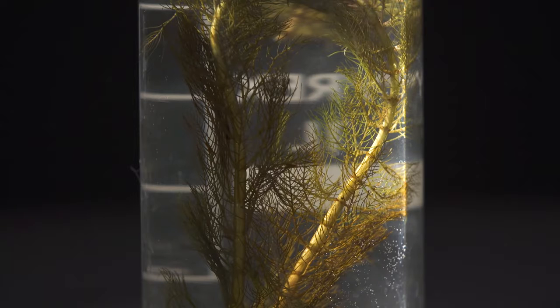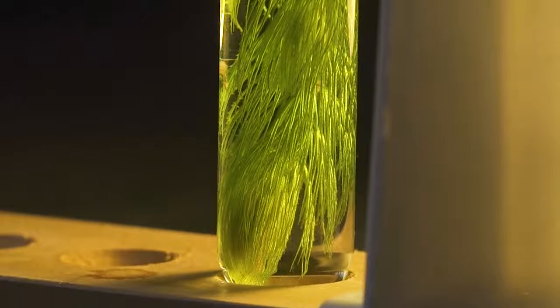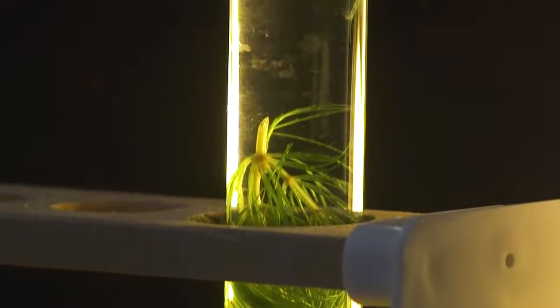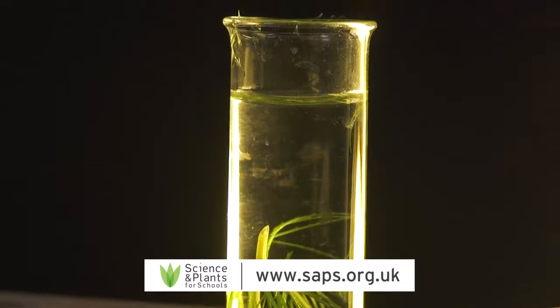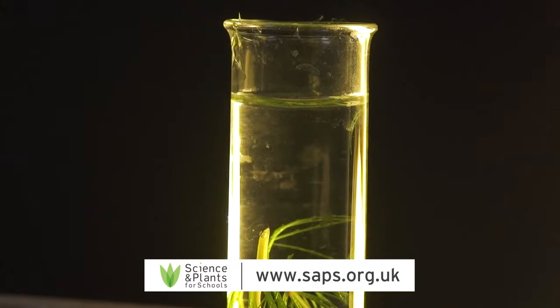When disposing of any plant material, always do so in the household waste to minimise the risk of introducing non-native species in your local environment. With a healthy and actively photosynthesising pondweed, and by following our tips for caring for it and for the practical itself, the practical will be a success. You can find out more about the pondweed species we've mentioned on the SAPS website.